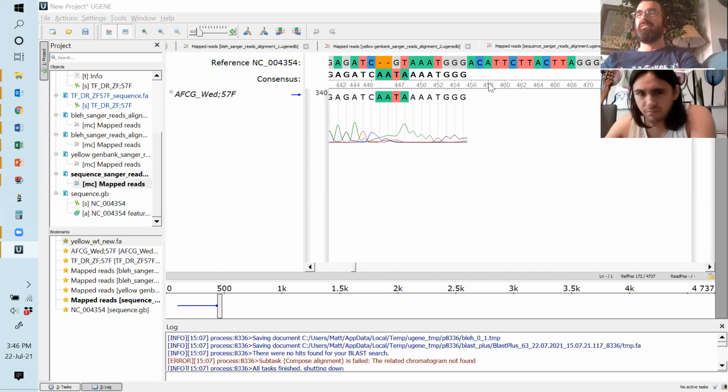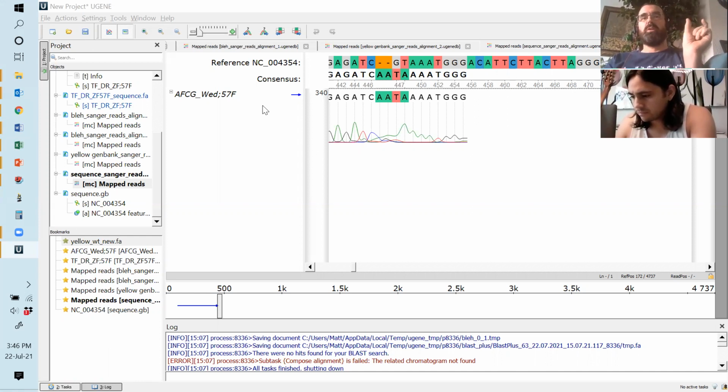Okay. 446. The end of the sequence that we're using, we're mapping. Not the reference sequence, the sequence we're mapping. Is that number higher or lower than 410? Exactly. So the PCR product has to include a portion of the intron. Now, if we have a bit of 5' UTR and a bit of the intron, what's the bit in between those two? Exon 1. Right, so that's the answer to that question.